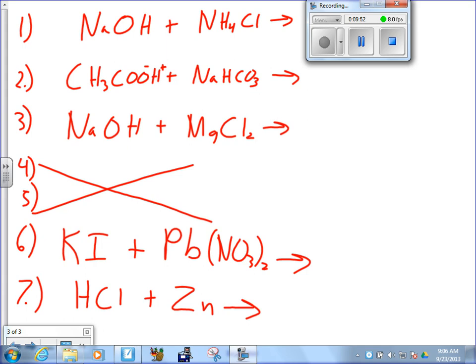Okay, steam, yeah, you might see steam, in particular water vapor. Okay, what else? Sometimes you can smell them. Yeah, all right. Odor change, is that a sign that a gas has been evolved? Okay, hint. For one of these reactions, the only sign that a chemical change has occurred is a smell. All right, there isn't even any bubbling.